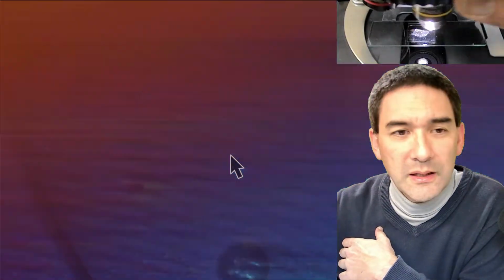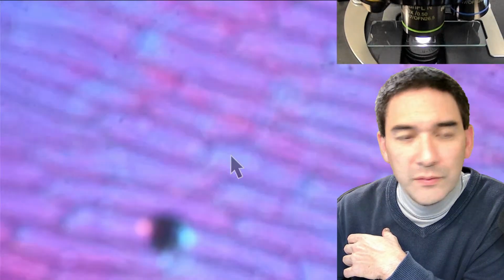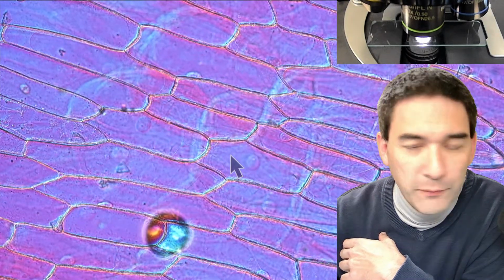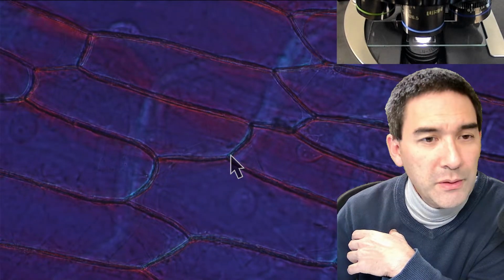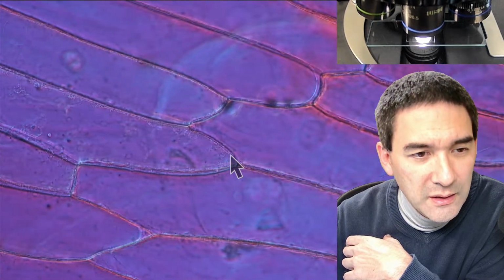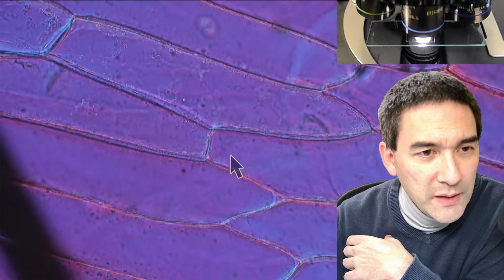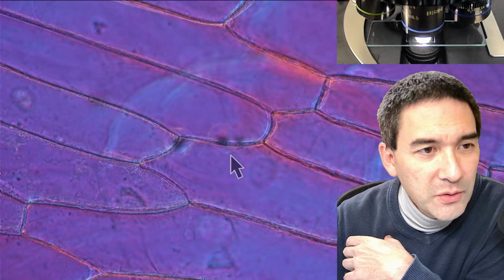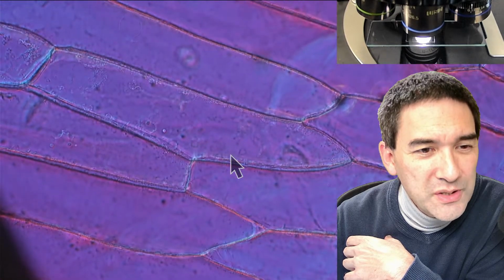Okay. I do not always want to redirect you to my other videos, but I did put onion cells under the microscope already before. I'm redirecting you because those videos are better than what we see over here. It's difficult to see because in the other videos I actually increased the contrast. But I'm just going to show you here. I'm just trying to find a good one. It's so difficult to see, but you know what? I'm just going to use this onion cell over here.